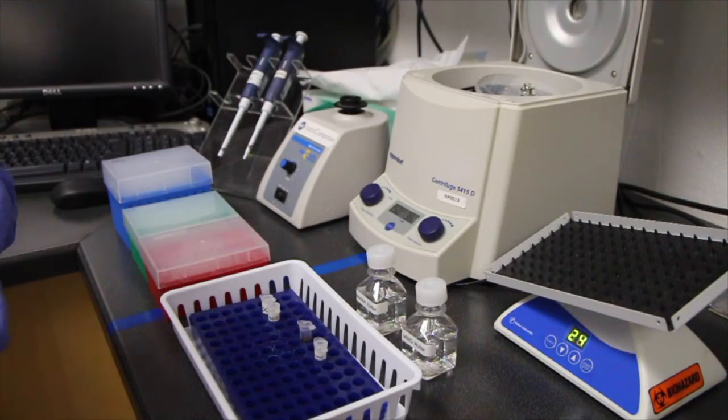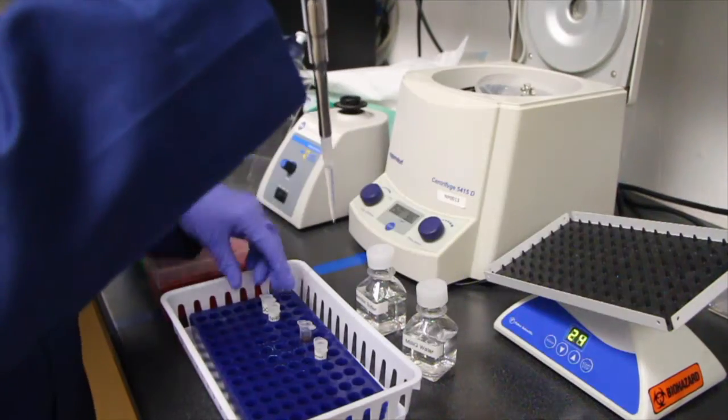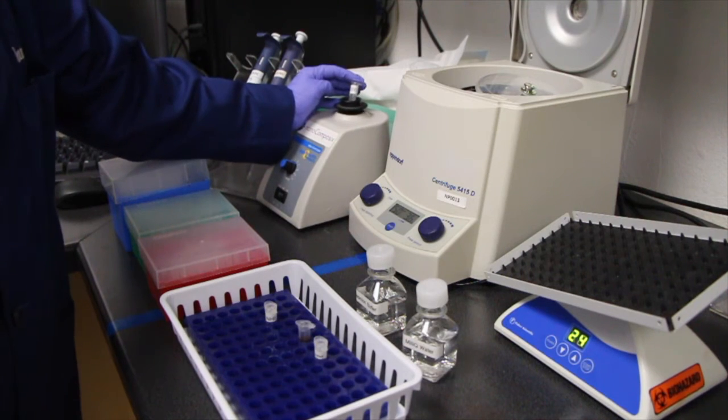Bring your aliquot of EDC to 10 mg per ml with water. For example, if you have 8.3 milligrams of EDC, add 830 microliters of water. Vortex to resuspend.